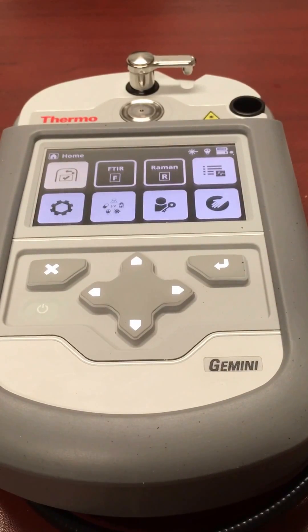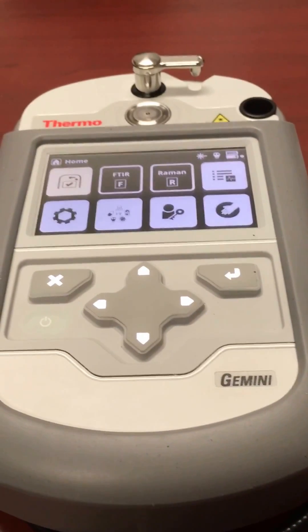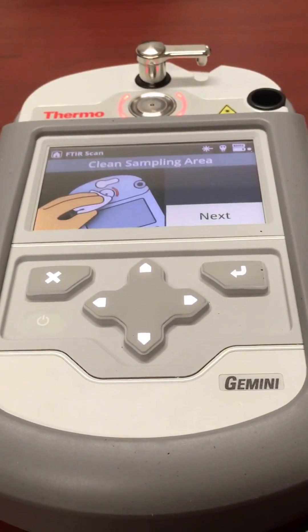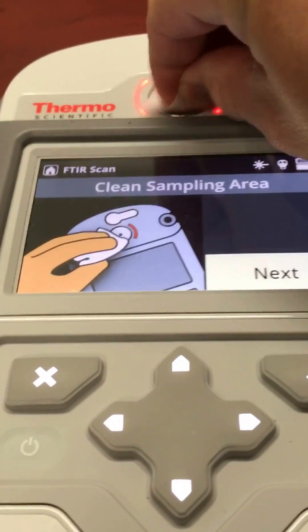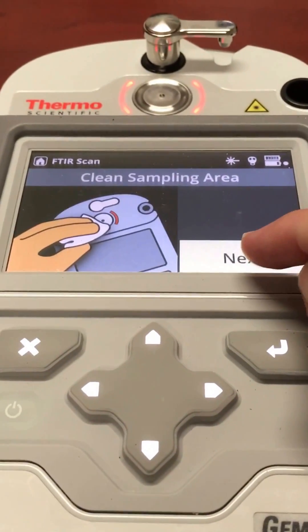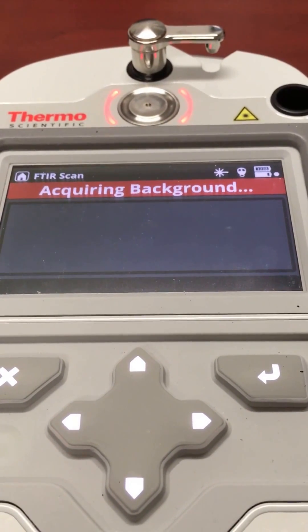To test a sample on the FTIR portion of the Gemini, first I hit FTIR. You can see the little space location lights up. I clean it with an alcohol wipe, then just hit next. It's looking at the background fluorescence.